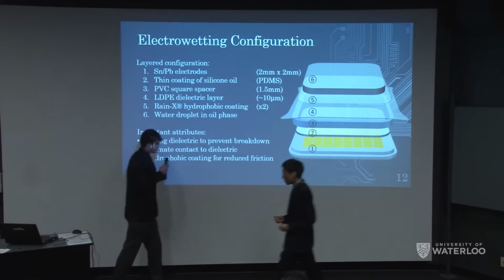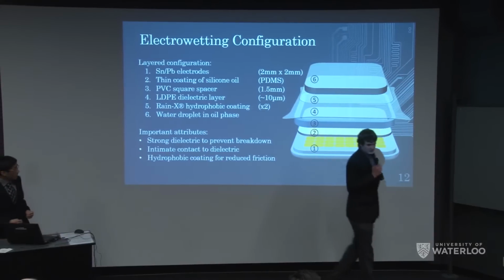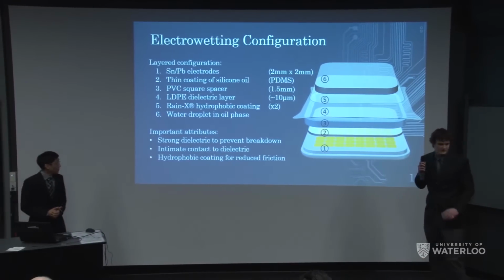And now moving on from the hardware and the software, the next step in our design process was to optimize our electrowetting environment.